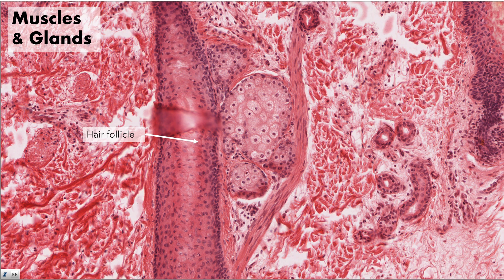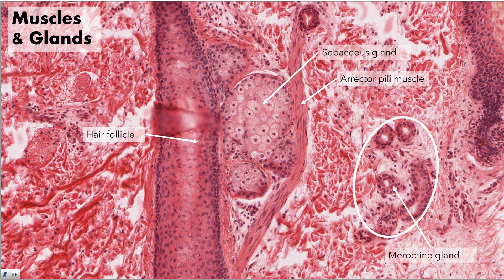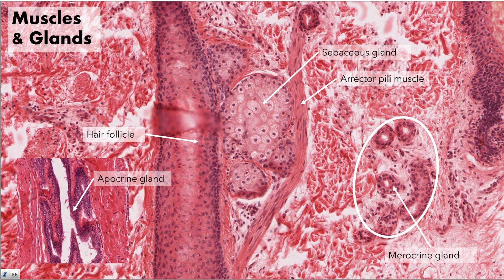Also found in the dermis are accessory structures like glands and erector pili muscles. Erector pili muscles are smooth muscle attached to the roots of hair follicles and to the dermal papillae. When they contract, they pull the hair upright, giving us goosebumps. Associated with hair follicles are sebaceous glands. Sebaceous glands take on a shape that varies from near spherical to kidney bean shaped. The cells are large with a centrally positioned nucleus in a very light staining cytoplasm. Merocrine glands are one of two sweat glands. They are formed from stratified cuboidal epithelium and form a coiled tube structure with the tubes in close association. Apocrine sweat glands are much larger in diameter with large lumens and thicker stratified cuboidal epithelium. These are found in the greatest quantity in tissues from the armpit, so you may not find many of them in our scalp slides.